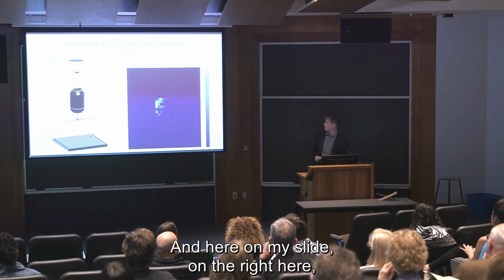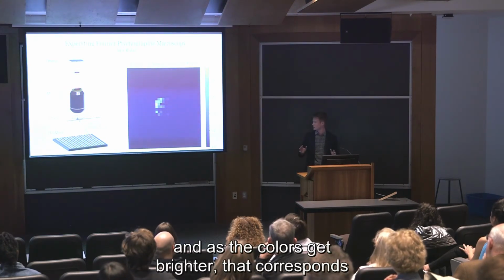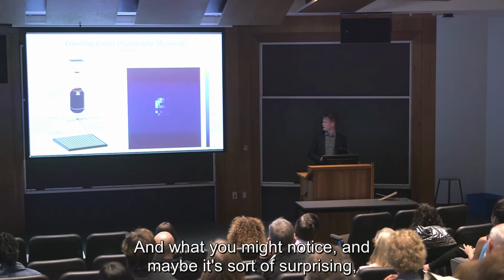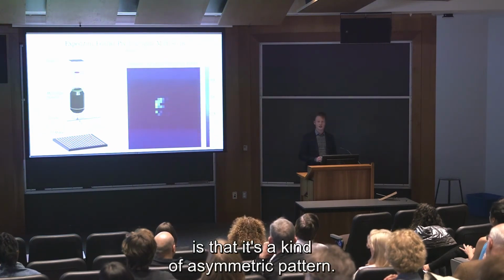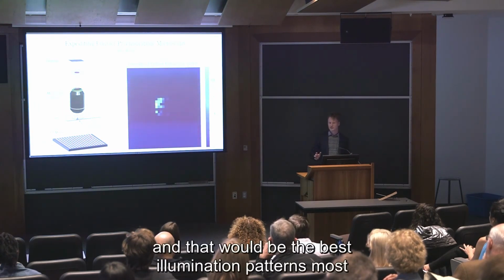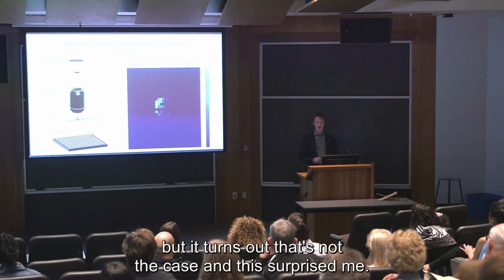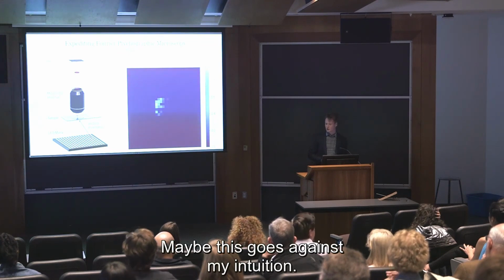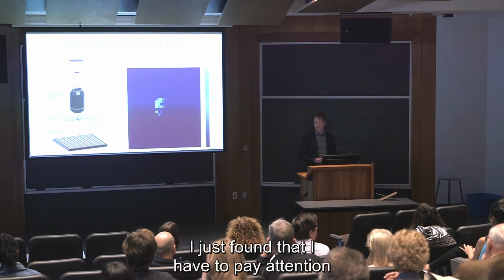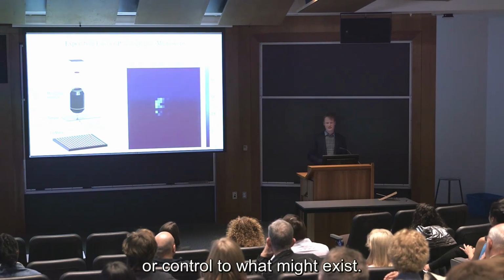And here on my slide on the right, you can see one of those images. The dark purple corresponds to LEDs that are turned off, and as the colors get brighter, that corresponds to LEDs that are on. What you might notice, and it may be sort of surprising, is that it's kind of an asymmetric pattern. Maybe you'd expect all the LEDs would be turned on, and that would be the best illumination pattern to most effectively reconstruct a high-resolution image. But it turns out it's not the case, and this surprised me. Maybe this goes against my intuition, maybe all the theory that I could have would point to a different conclusion, but in the end, I just found that I have to pay attention to what the machines are telling me and give over control to what machine learning says.